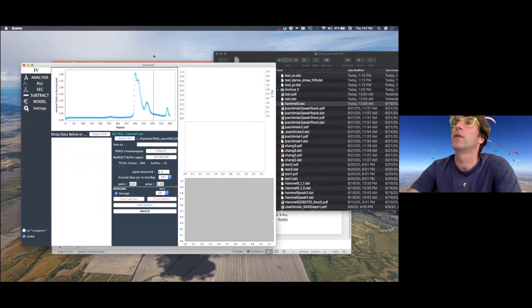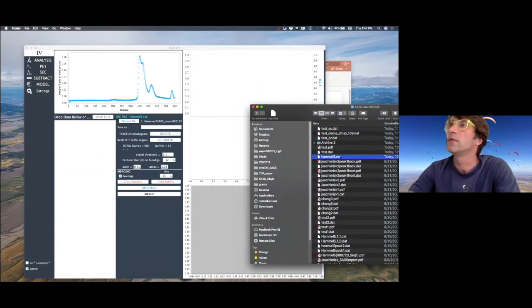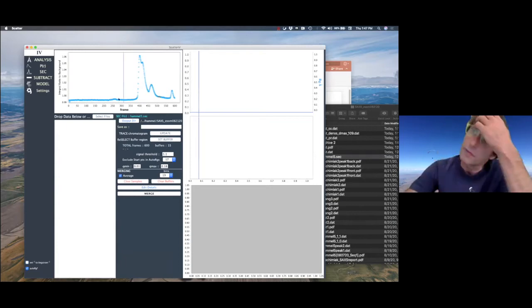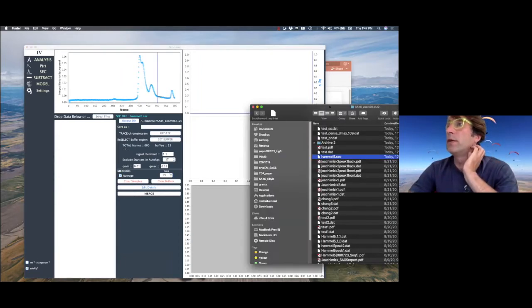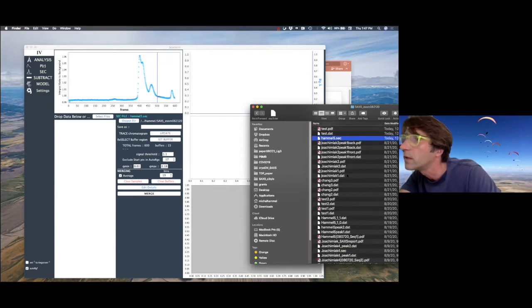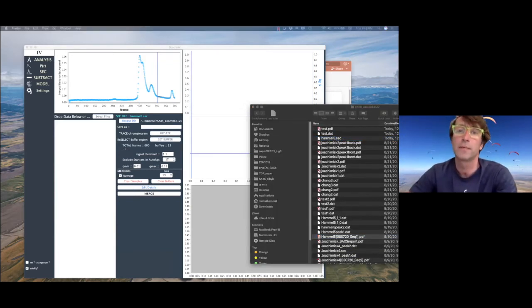This is how it looks like. You get this SEC file too, as you see. Obviously here we have some aggregations. We can confirm that by looking at the PDF file. Oh, here we go. So look at that PDF file now.